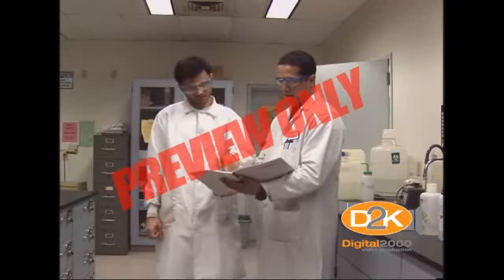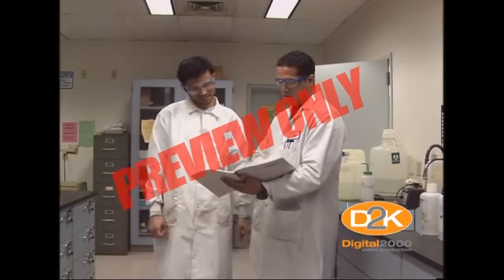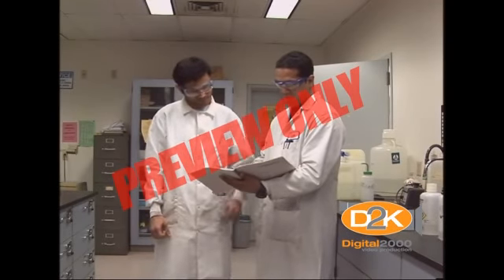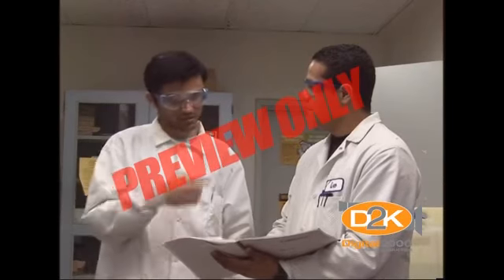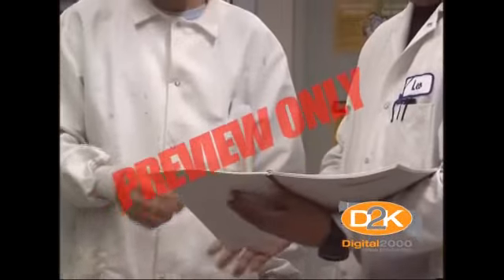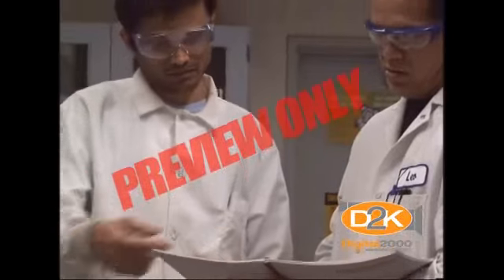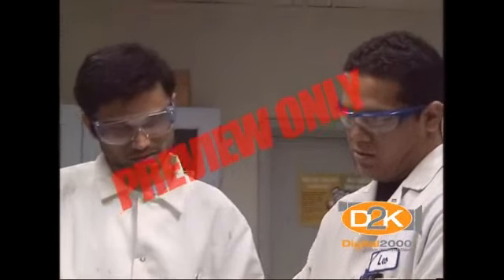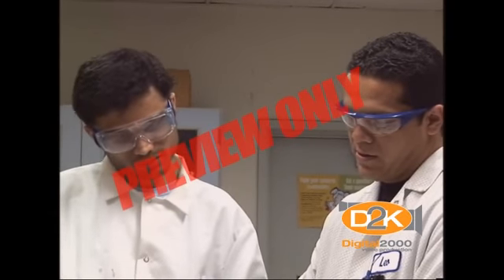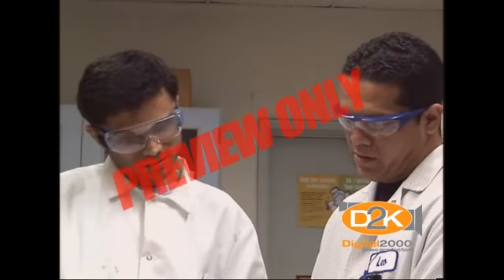All personnel working in laboratories or facilities where chemicals are used or stored must receive chemical safety training before starting work. This training must be renewed annually. Chemical safety training familiarizes you with common chemical hazards, your university's chemical hygiene program, and safe practices for acquisition, use, storage, and disposal of chemicals.